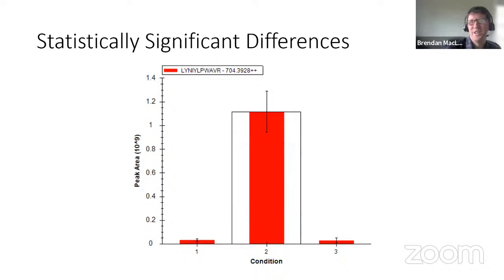Okay, so now pulling up to the satellite level, what if we'd gone to that level and we'd even run MSstats and it was telling us this peptide was statistically different? I actually start by asking, do people think that these are statistically different? That 1 is statistically different from 2 and 2 is statistically different from 3? Probably most people would say, yeah, we can't really say 1 is statistically different from 3. But what do people think about these? Unfortunately, you can't answer, but most people will go, yeah, of course, look at how different they are. I totally believe they're statistically different.